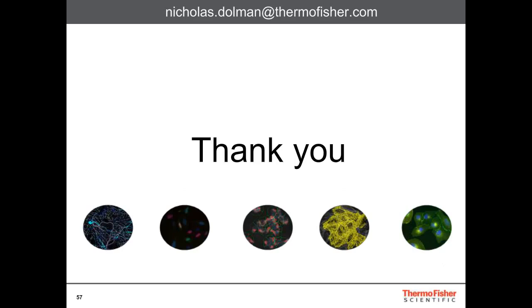So yeah, that's a very good question. Not only do you need the optical systems that are able to image within these spheroids, things like very, very robust light sources from the LEDs, but also confocal capabilities for detection. You do also need to validate the reagents, make sure they're permeating all the way into the spheroid. So we are actively working on validating a number of our reagents in these models, looking at ways in which we can improve permeability and reduce non-specific binding as well.